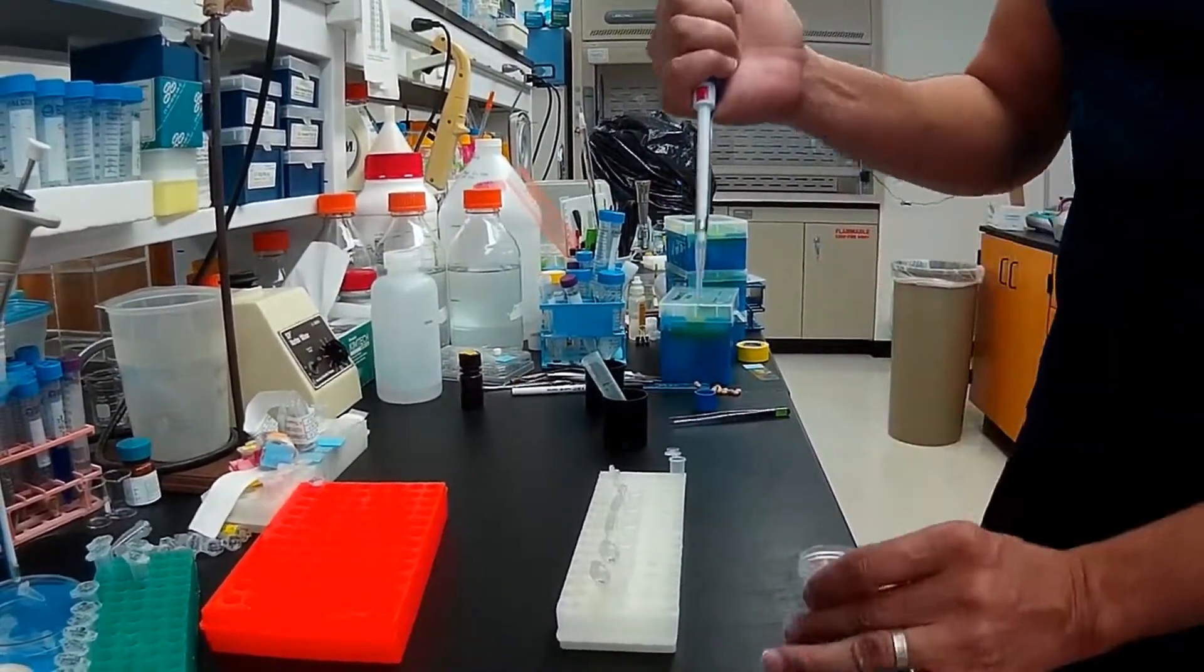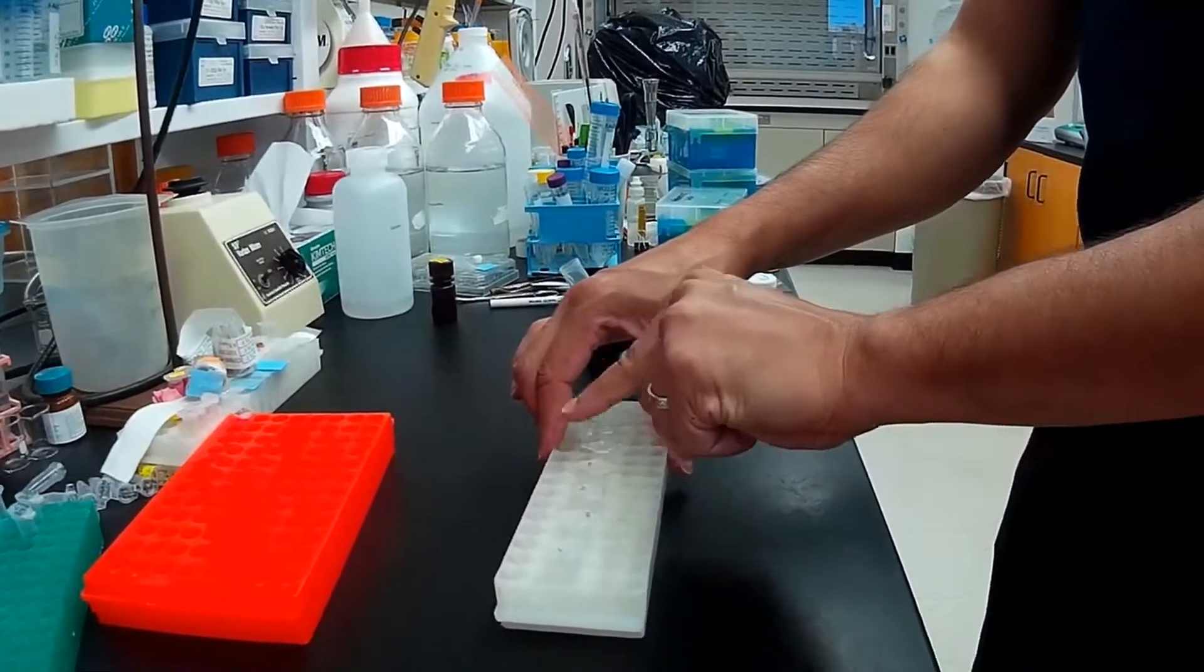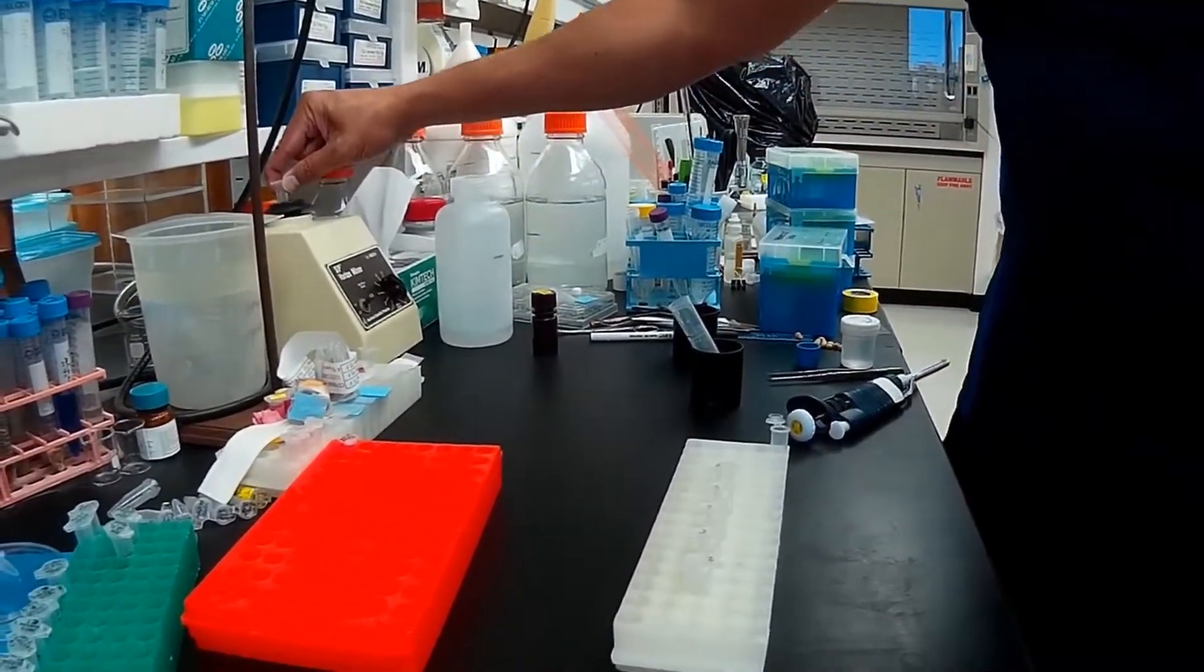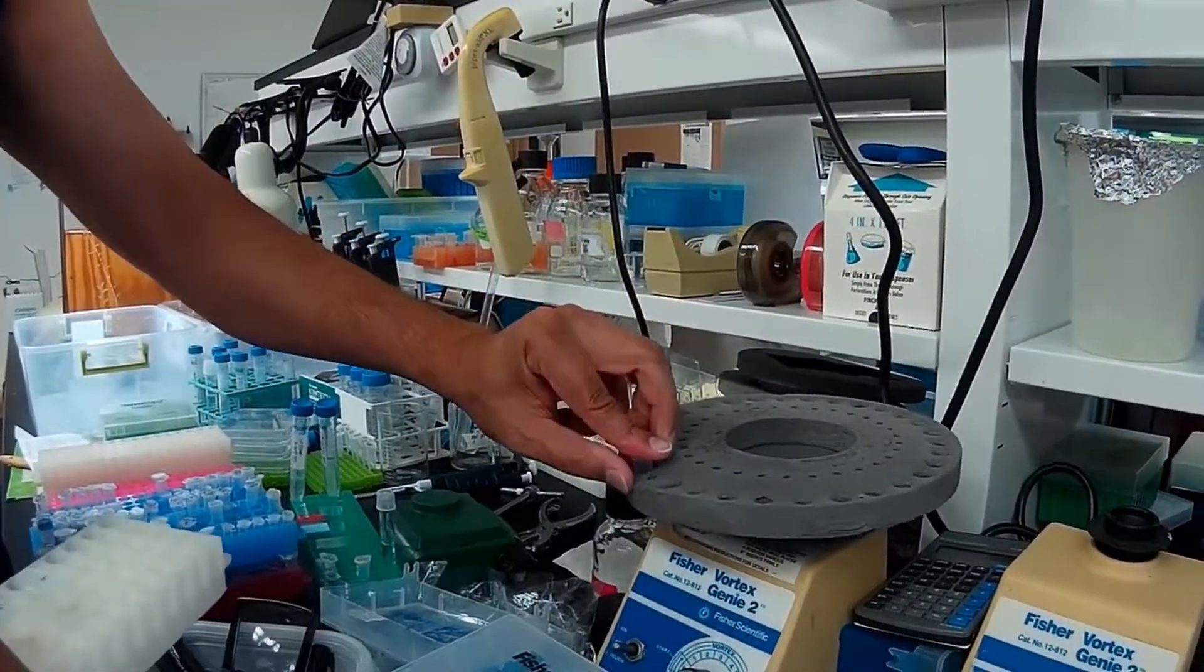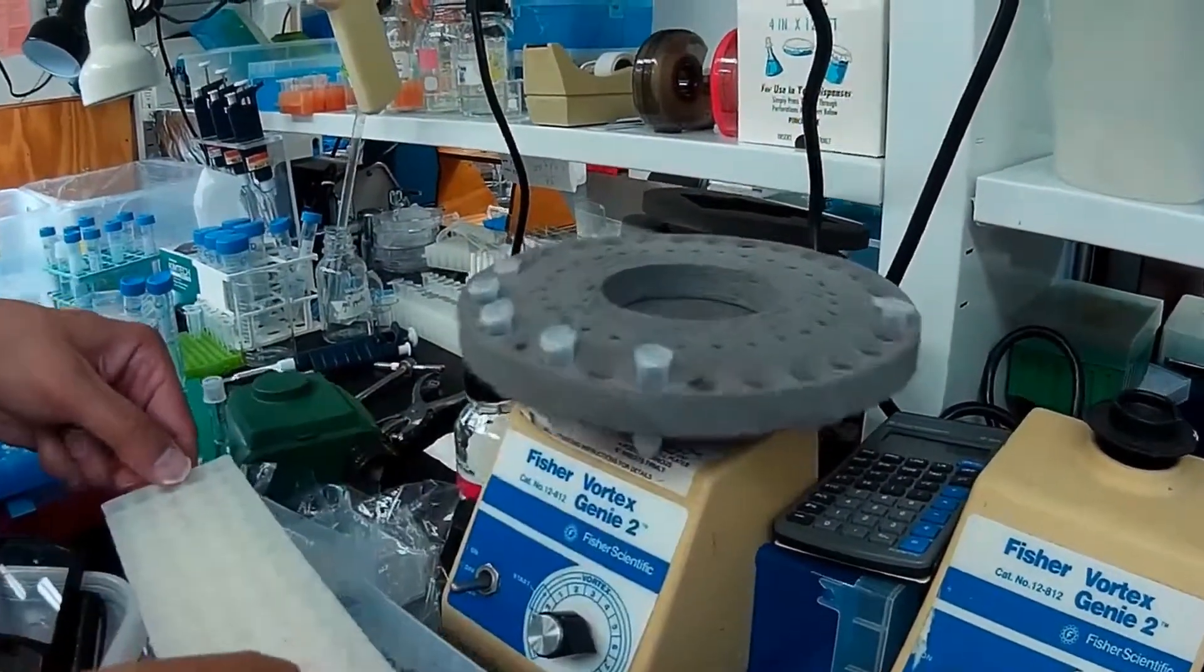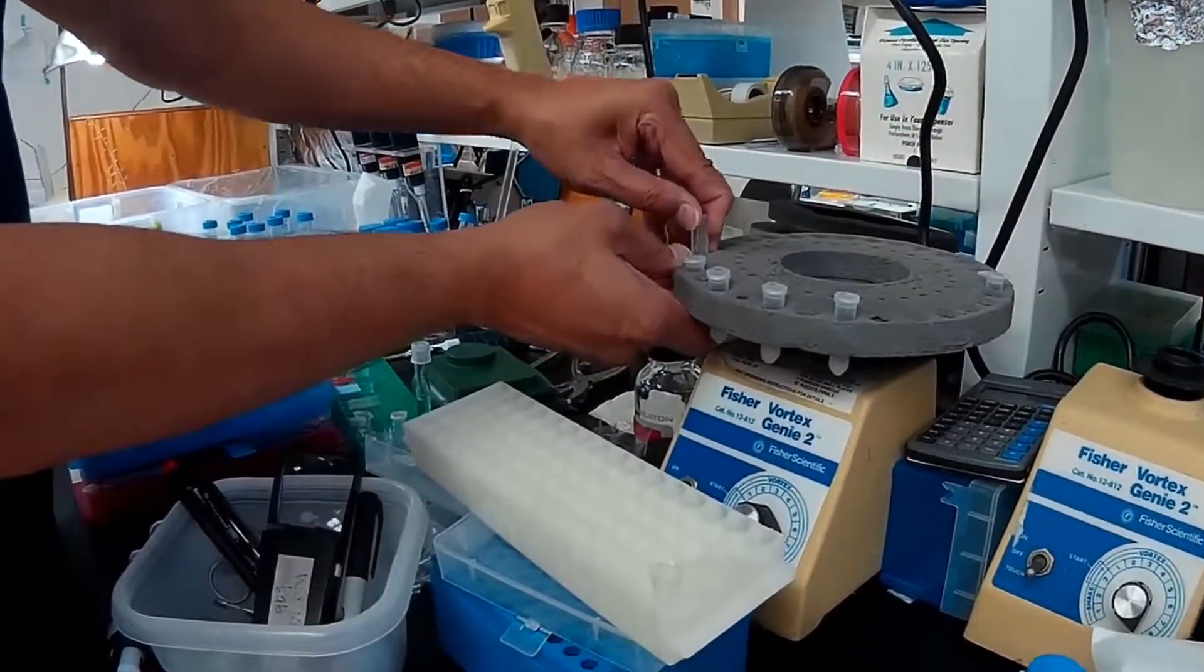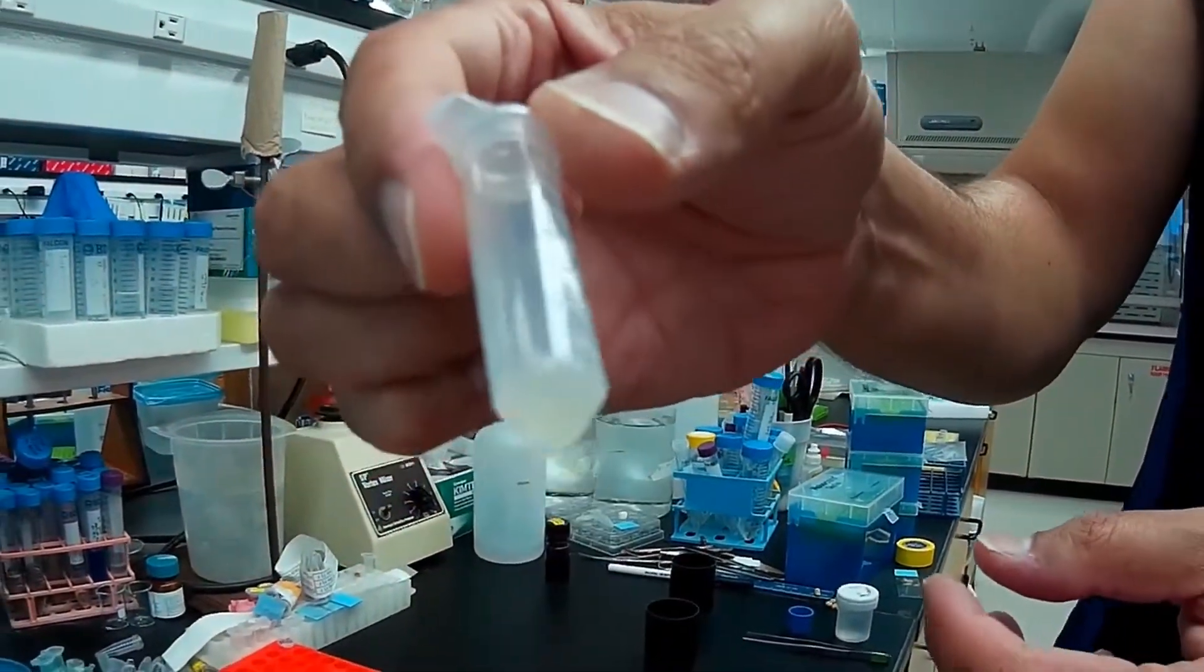100 microliters of solution one is then added to the E. coli pellets. The bacteria can be re-suspended by vortexing or pipetting. Here I'm showing the use of a multi-vortexer. It is very important that the pellet is completely re-suspended if you want to get maximum DNA yield. You can see there's no more chunks of E. coli.